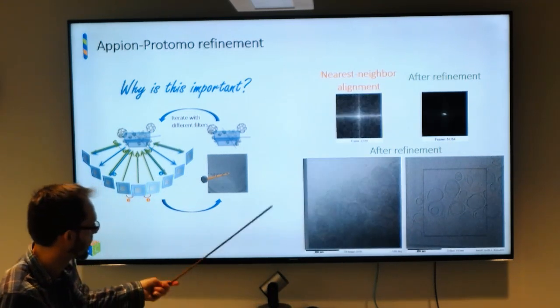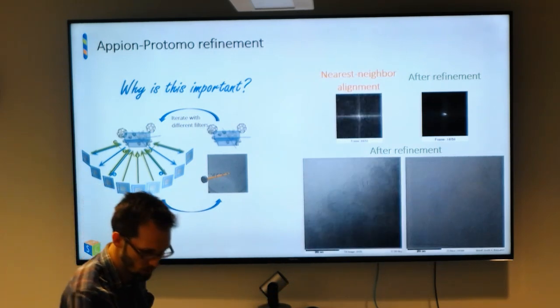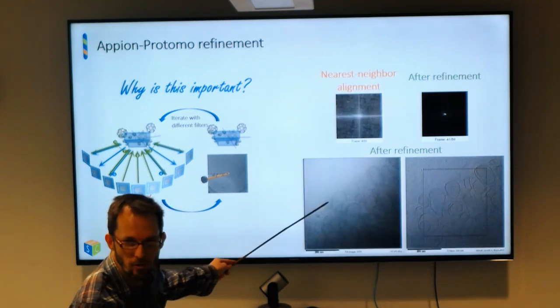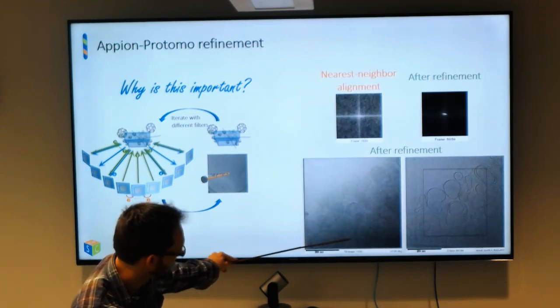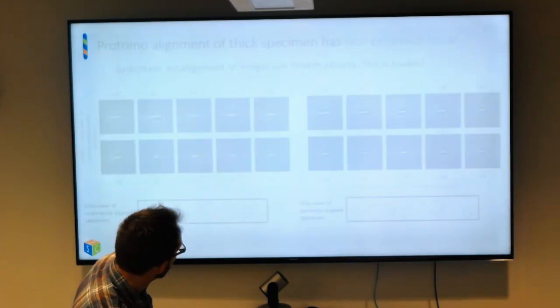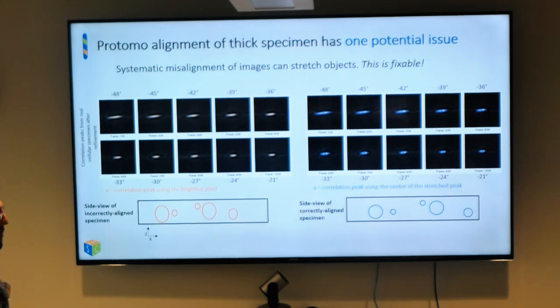This is a sample of some liposomes with some reconstituted cell adhesion molecules in them, between 50 and 150 or 200 nanometers thick on the bottom right. All right, so that alignment method enables some projects and can significantly expedite some other projects because you don't have to collect gold beads.